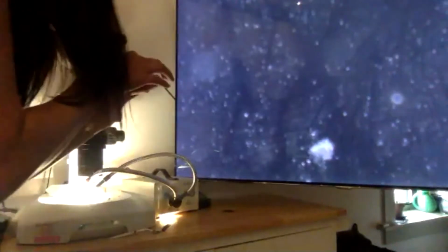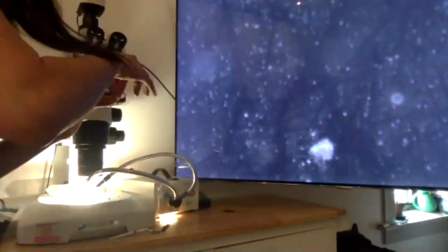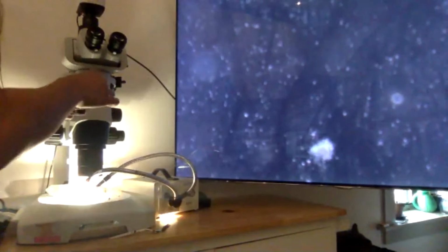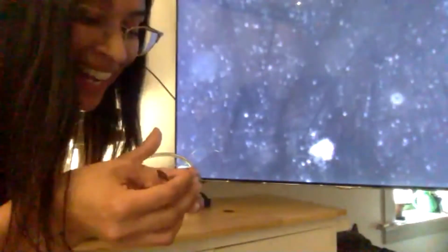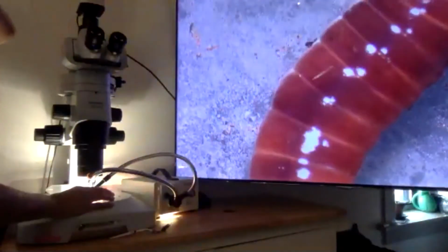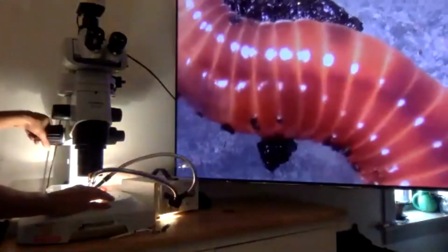While you do that, a quick note. Apparently, one of those egg sacs hatches about 20 worms, and they produce 2 or 3 of those cocoons every single week. Cool. Thanks, Emily. Okay, the reason they're called red wigglers is because they are very, very wiggly and a little tricky to pick up. But I got one. Woo. Okay. So let's check out this guy and see what parts we notice inside.